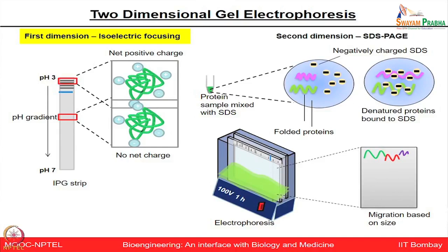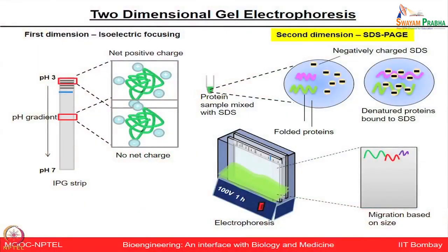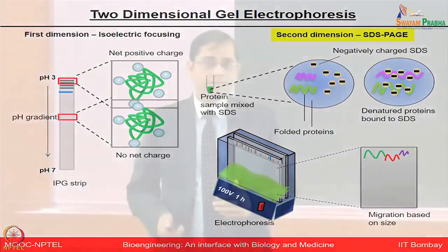isoelectric focusing, when pH equals pI, then there is no net charge, and proteins are separated based on that, depending on what IPG strip you have used. Then in the second dimension, we separated proteins further in the SDS-PAGE based on their molecular weight, and proteins migrate based on their size.